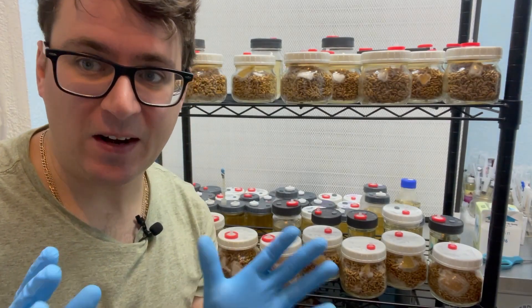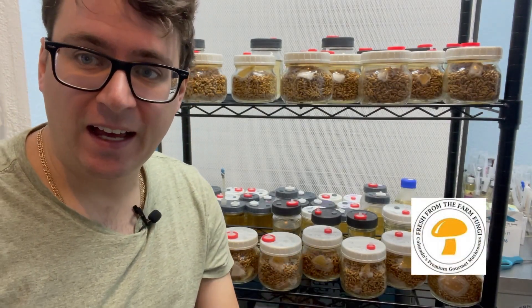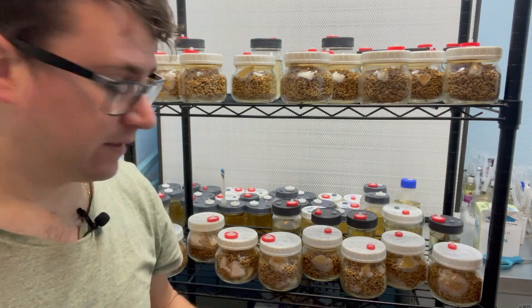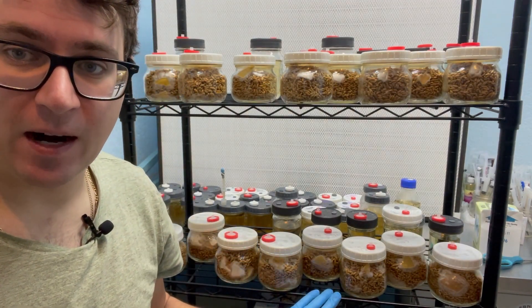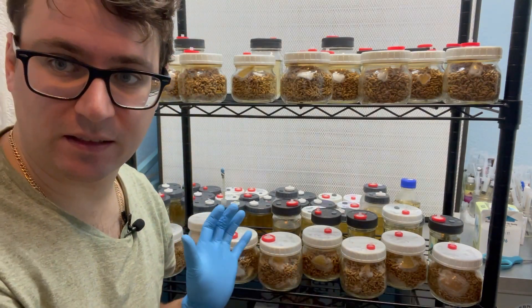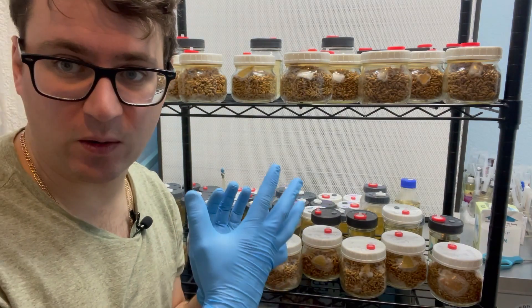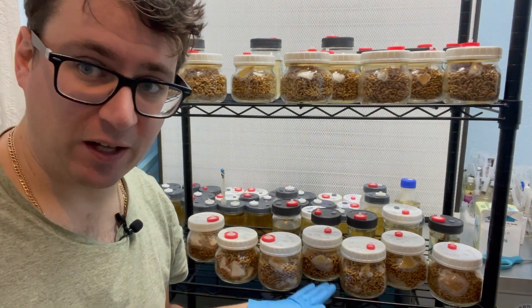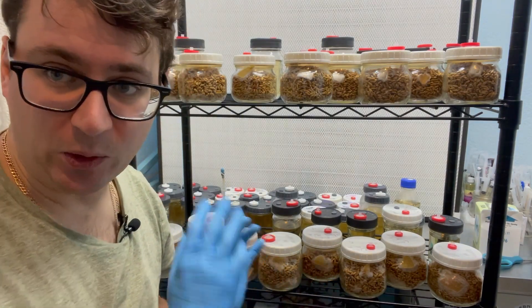What's up mushroom fam? It's Gary with Fresh from the Farm Fungi. I'm here in Denver and it's been three and a half days since we inoculated our grain spawn with the various species that we're breeding. I just wanted to do a quick update on how the grain spawn is developing and some things that I'm looking for.